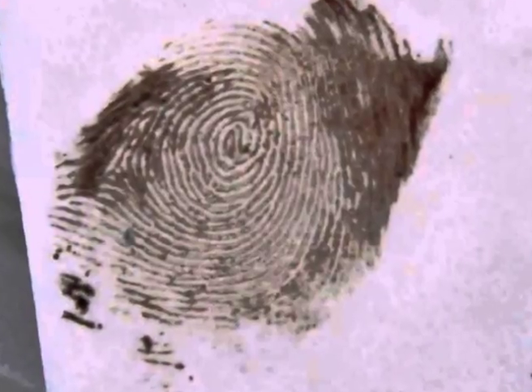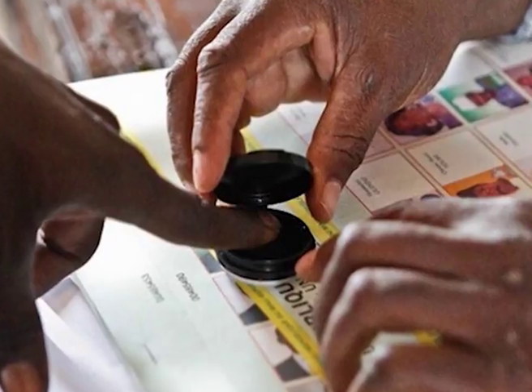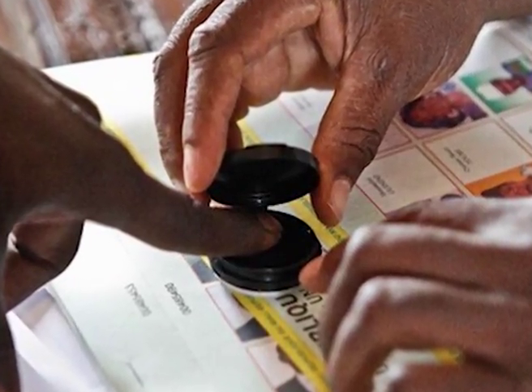The ninhydrin and iodine fuming methods of fingerprint detection do not interfere with the silver nitrate technique. Thus, this method may be used as a final step to reveal fingerprints when the other conventional methods do not yield results. In fact, if the fingerprints developed by ninhydrin on a particular surface are weak and faint, the item may be post-treated with silver nitrate to give a better contrast.